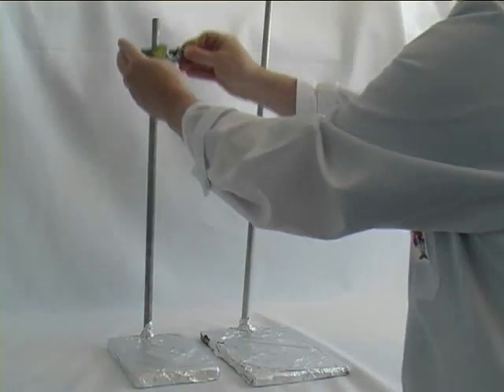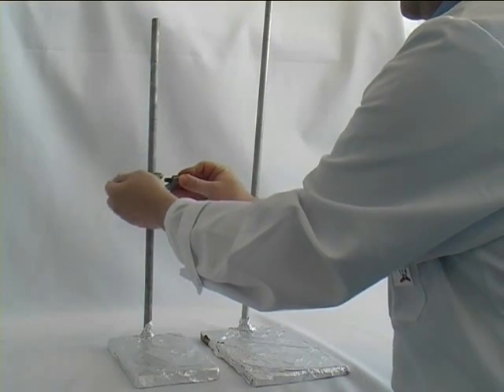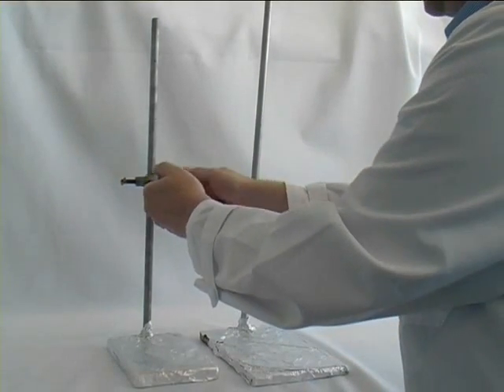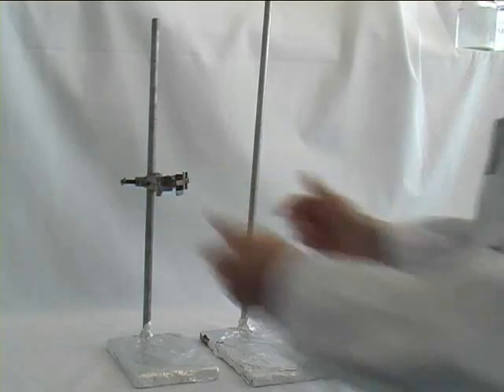This time we need two retort stands. In the normal fashion, we will assemble it with bosses and clamps. Make sure that the opening of the bosses points upwards again.